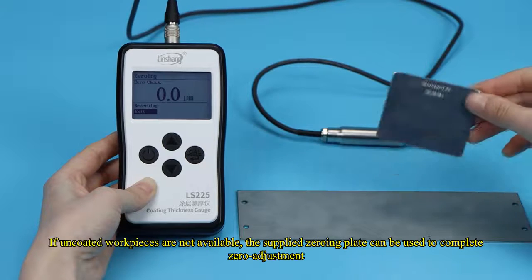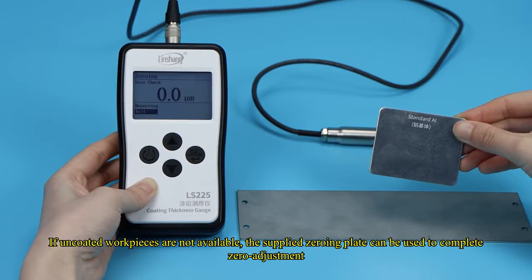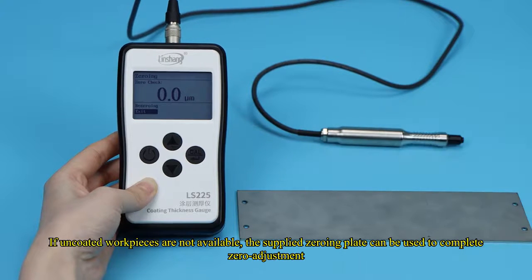If uncoated workpieces are not available, the supplied zeroing plate can be used to complete the zero adjustment.